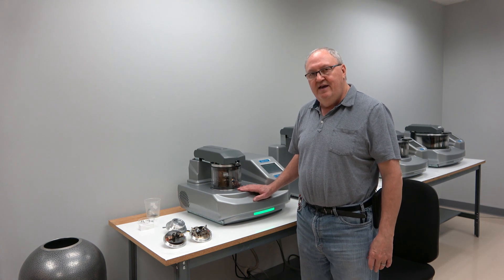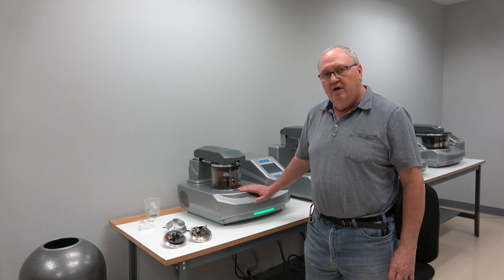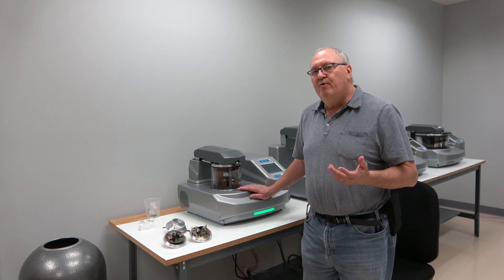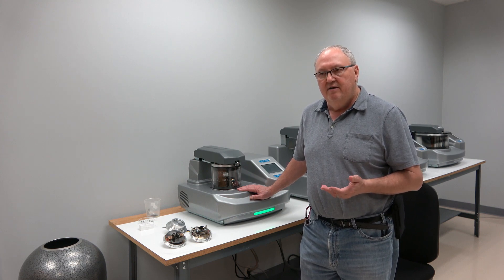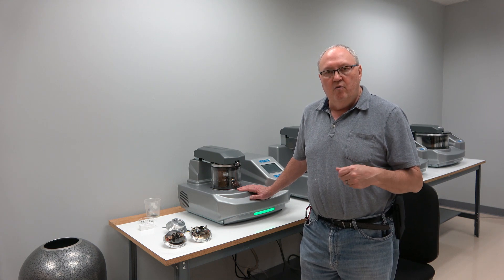The VES Plus that I have here is the pinnacle of the benchtop coating tools. Let's talk about this, and then we'll talk about the differences between the Q150 VES Plus, the Q150 TES Plus, or the Q150 RES Plus — the full range of the Q-Series 150 models. The way they're separated into pumping abilities as well as whether they can evaporate, sputter, or both is denoted by whether it has an R or a T followed by an E, S, or ES.